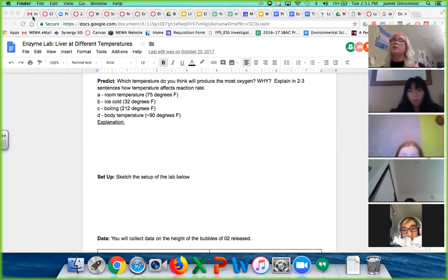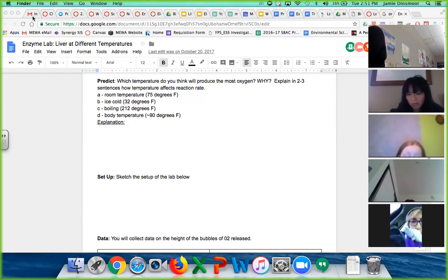Good, so I like that you guys are connecting that heat does speed up reactions, right? Or heat does help reactions. So that is a good thing to note, right? And we will find out in a moment if you are, in fact, correct.